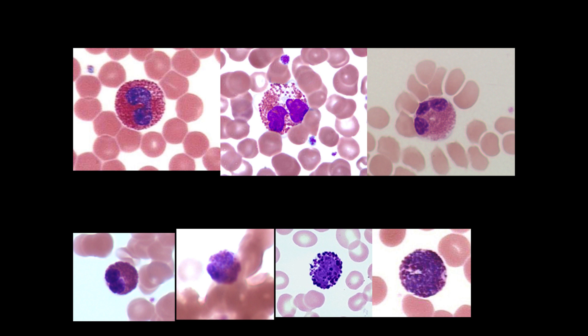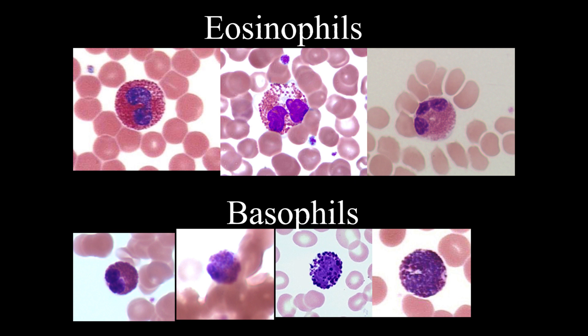Eosinophils and basophils are the unicorns of leukocytes — the most difficult to find — and students get excited when they finally spot one. Eosinophils and basophils are also granulocytes, but unlike neutrophils their granules are really well defined — the cytoplasm looks like it's carrying real pebbles. The difference between them is that eosinophil granules stain pinkish-red, while basophil granules stain dark purple or dark blue.